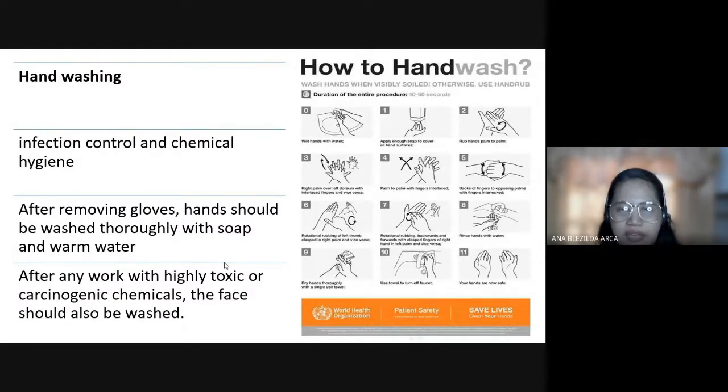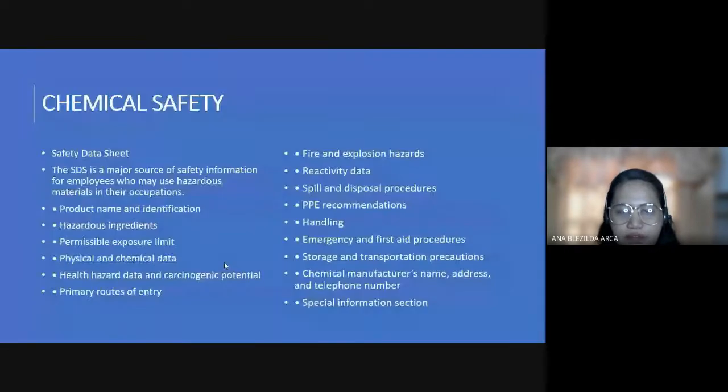Okay? Yan. So, for the chemical safety naman, we provide the safety data sheet or the MSDS. Now, for the safety data sheet class, ito yung document, as in papel siya, literal na papel, okay? Na makikita mo kasama na mga chemicals na binili nyo in the laboratory. So, whenever you purchase a chemical, there is always a safety data sheet. Requirement yan, class.